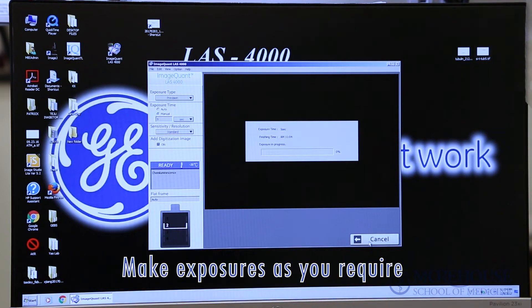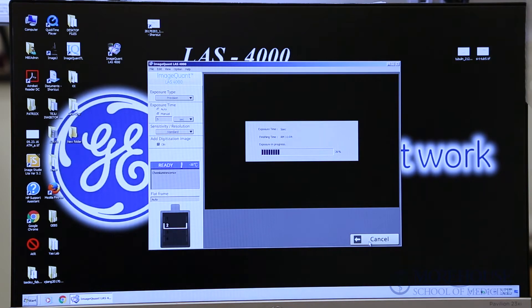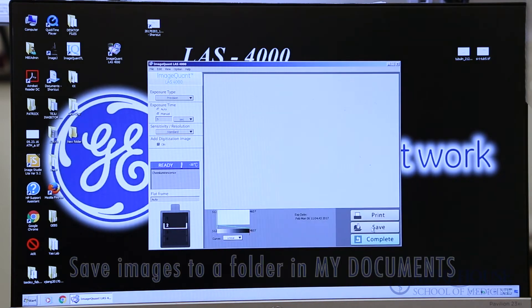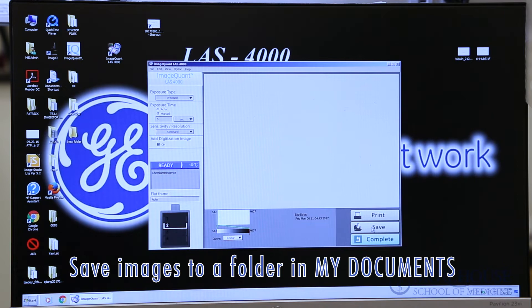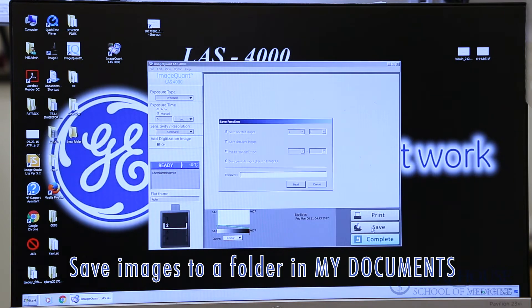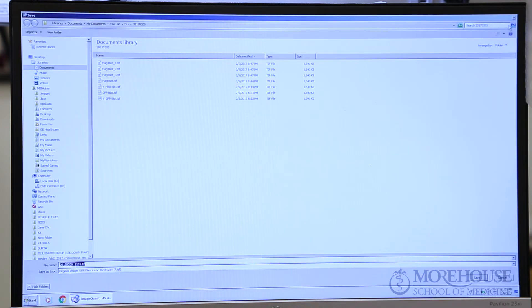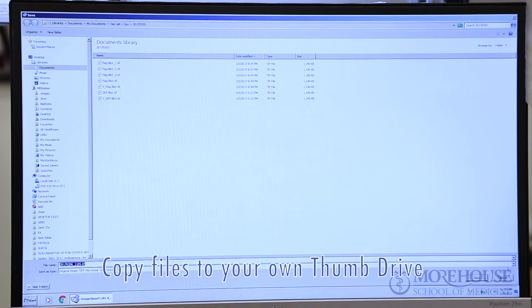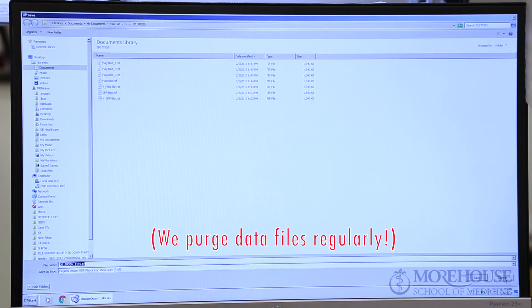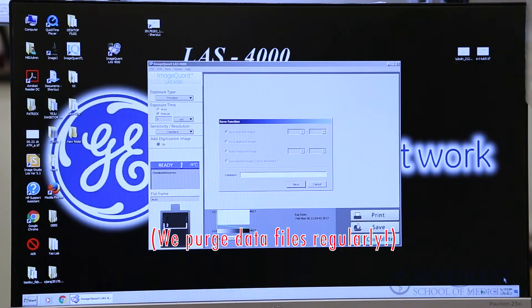Make exposures as you require. Save images to a folder in My Documents and copy files to your own thumb drive. We will purge data files at regular intervals.